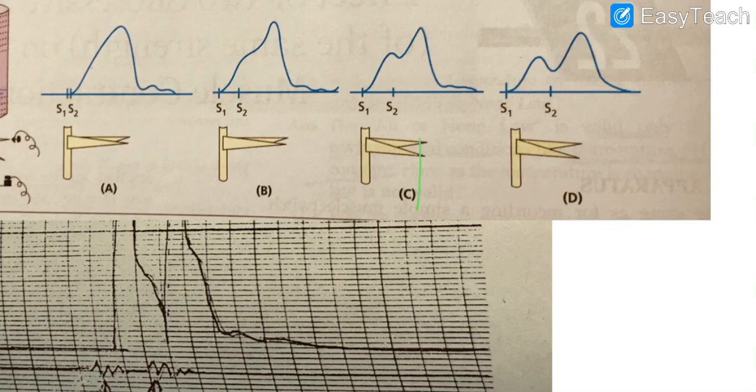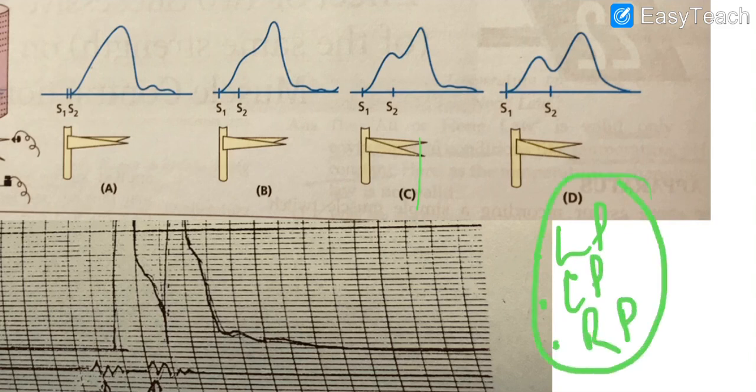In what phase? We can say there are three phases: one is during the latent period, one is during the contraction period, and the other one is at the relaxation period. We won't get any effect during the latent period. During the contraction and relaxation period, there will be increase in the amplitude, due to the beneficial effect, right?